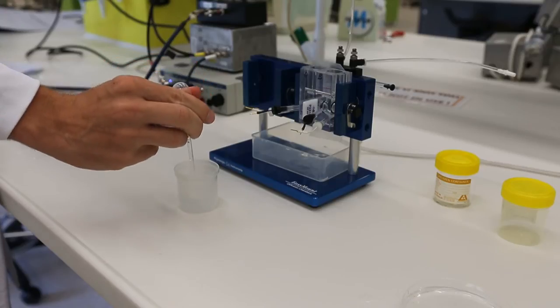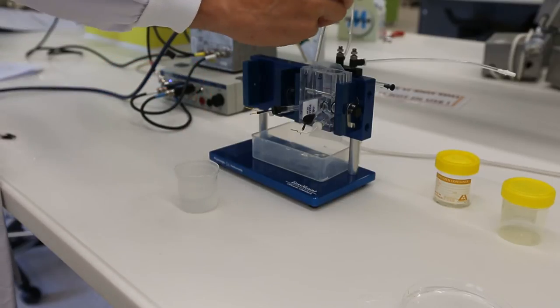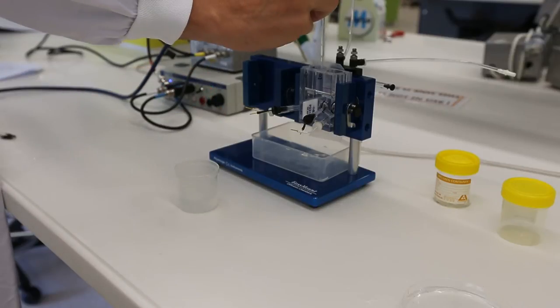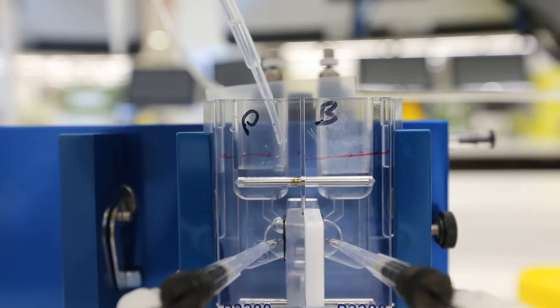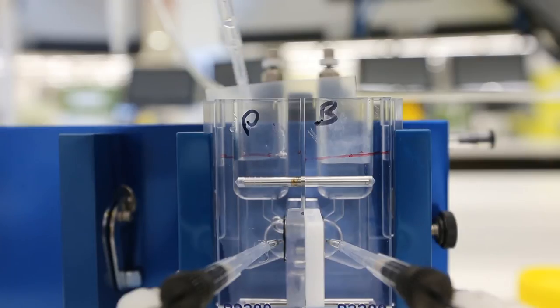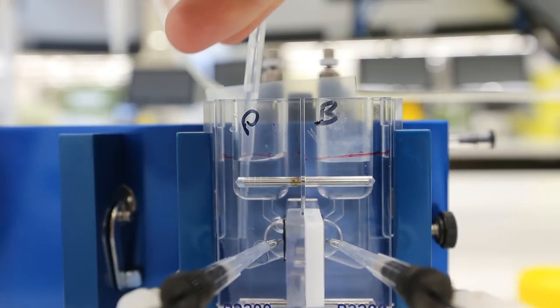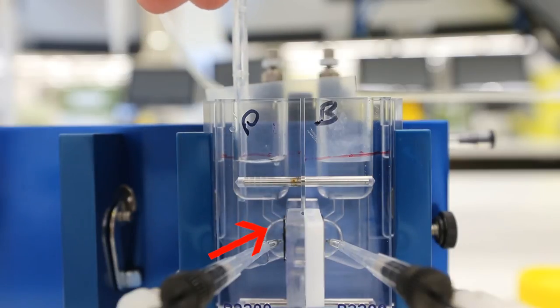Next, we need to fill the Ussing chamber with normal toad ringers. Use the transfer pipette to squirt ringers solution into the Ussing chamber until you reach the red fill line. This is approximately 5 mils. If you notice that there are any air bubbles in the chamber, as shown here, be sure to dislodge them before continuing.